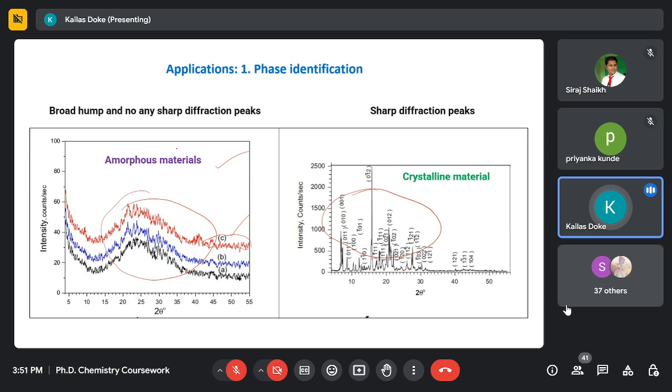You can find the answer next time. Tomorrow I will ask. Since all these are combinations, A is equal to B is equal to C. What are these? These are the lattice constants, the distance along the x direction, along the y direction, along the z direction. If they are identical, or these angles at one interface, second interface, third interface of that particular crystal are identical, then it is called a cubical crystal.